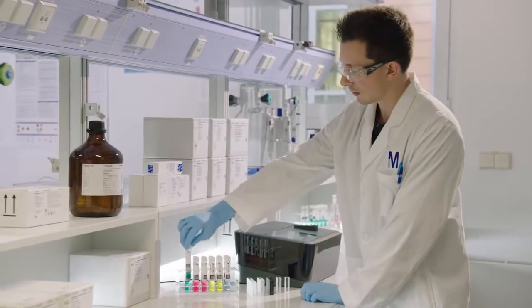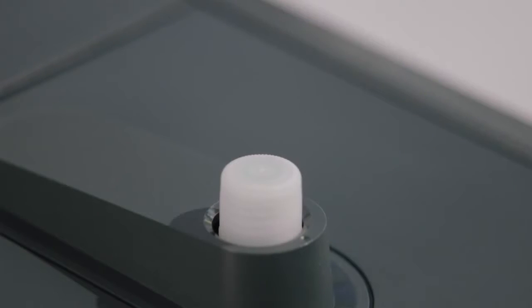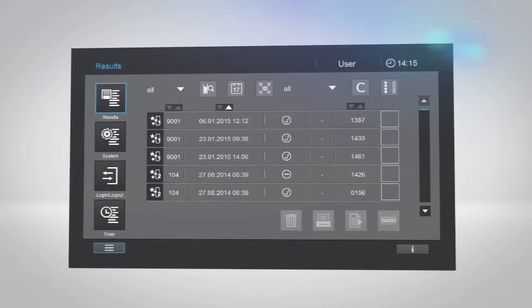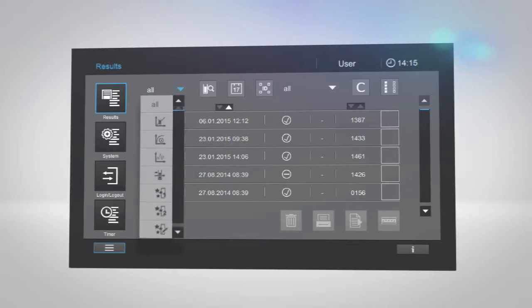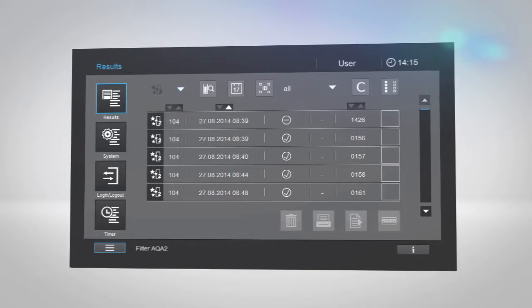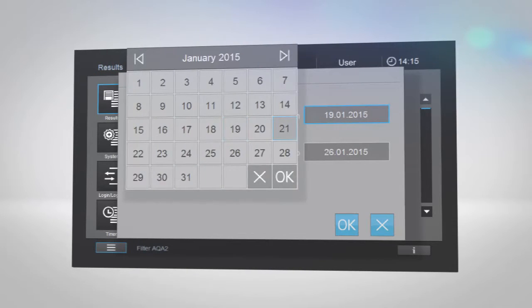SpectraQuant Prove gives you data on demand like never before. Its ingenious software lets you easily manage and customize your results to suit your needs. There are multiple ways to share your results with others, and you have several filter options to choose from, such as by mode, by username, or by date. Tap the Results icon to see all your measurements listed according to date. Tap the Calendar icon to filter by a certain period of time.